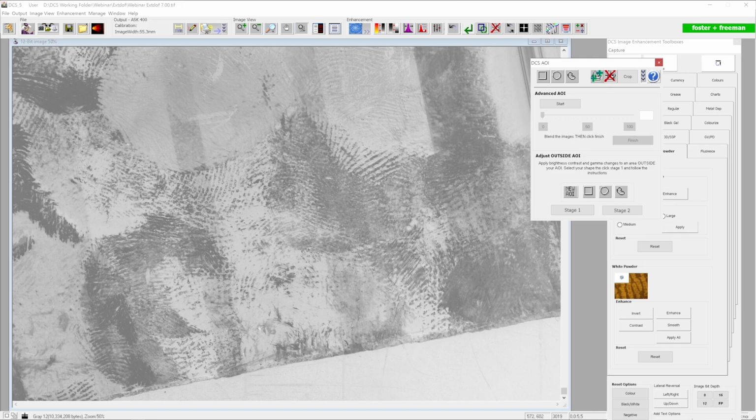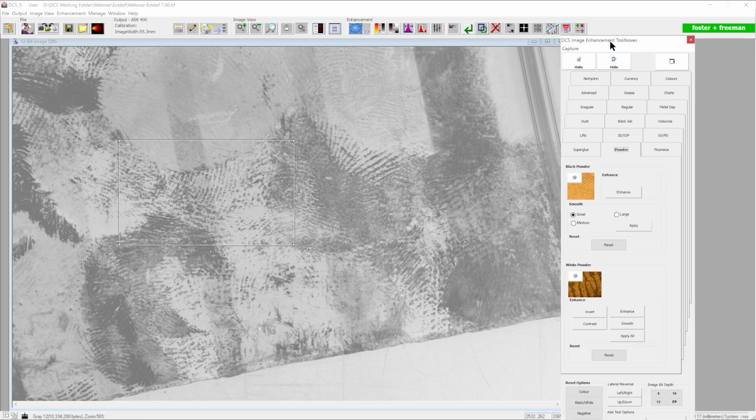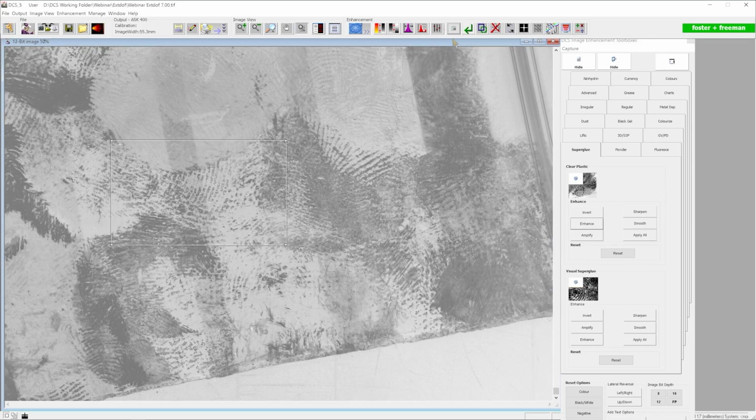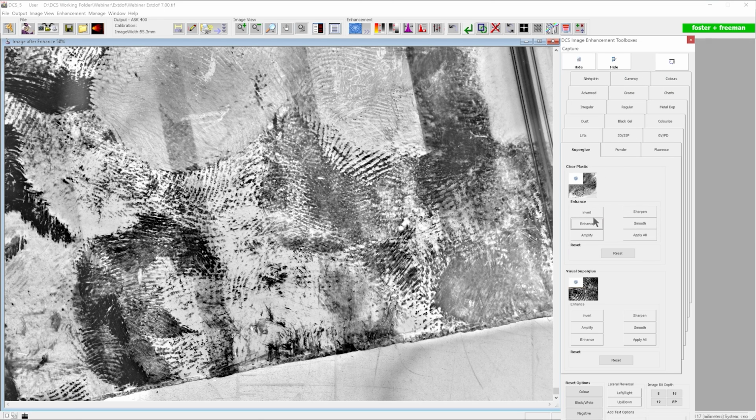Then we could maybe use our area of interest tool and come to the superglue tab, and see if we like the effect from something like enhance. Sometimes that can be a bit much, because obviously we can see quite good contrast in this mark already. So I actually prefer applying that enhancement across the whole image.